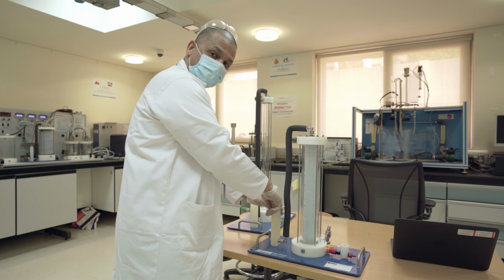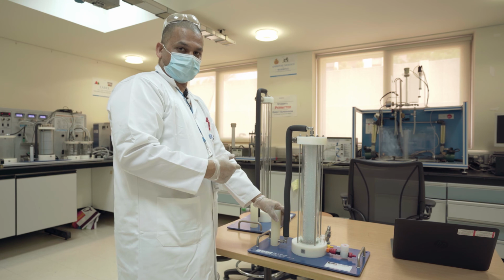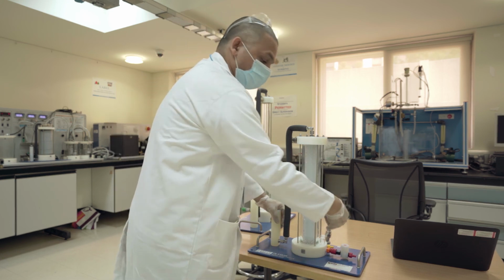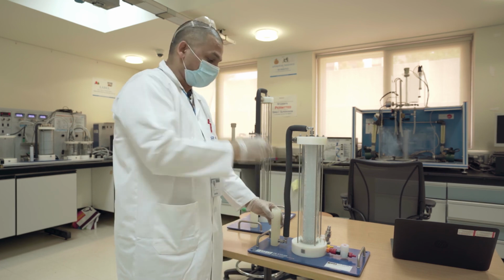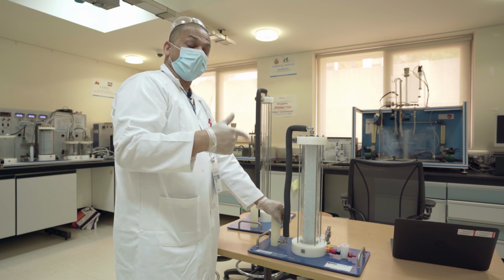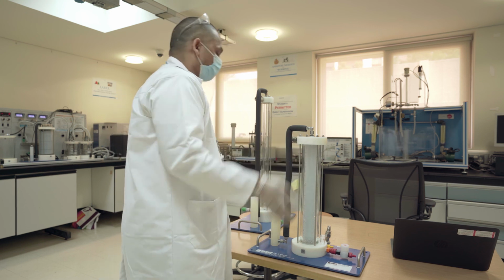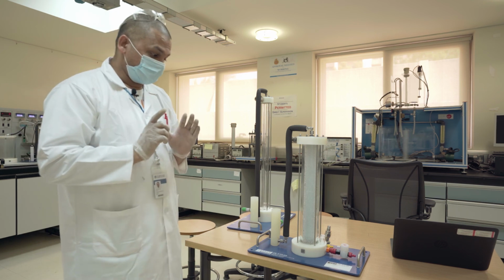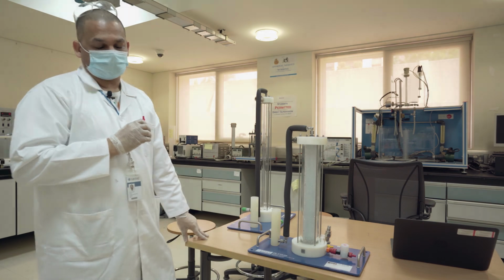So we measure again the conductivity from the outlet, and we find out the unknown. One experiment I do at room temperature, another I can do at a high temperature, another at another temperature. So 3 temperatures and the final conductivity, plot the temperature versus the conductivity, and take the intercept and slope to find out the value of the Arrhenius constant and the activation energy. This is from here, the same from here, or from here. The theory is the same, the logic is the same. It helps me to plan, identify, and calculate the unknown kinetic parameters.